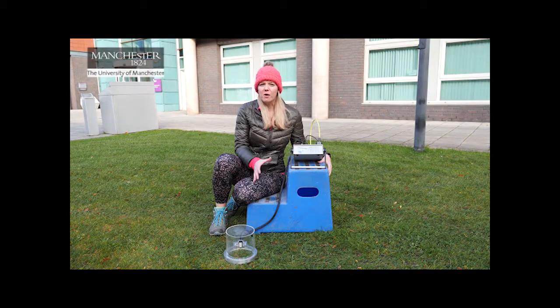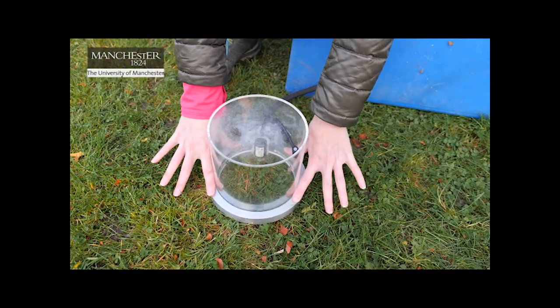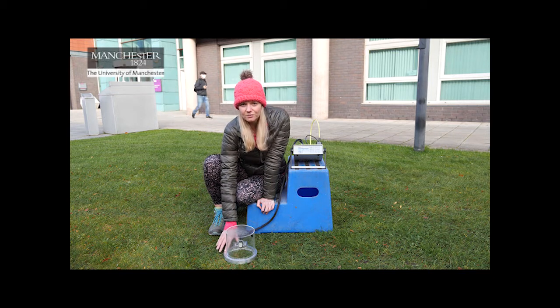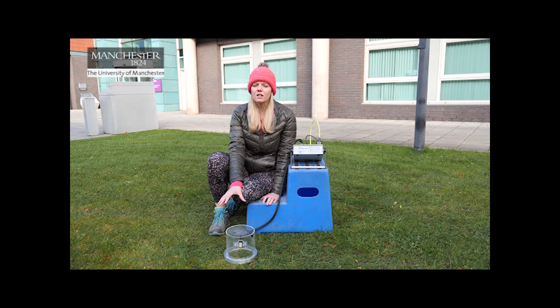Now that we know how both instruments work, we're going to use them to take some measurements — some practice recordings of CO2 fluxes from the surfaces around us today. We have our gas assimilation chamber with a nice tight airtight seal, and here we're going to be measuring and monitoring the carbon fluxes from grass and the underlying soil. It's a November day, about 10 degrees, not particularly sunny, and we have soil and vegetation here. Before we start the reading, have a think — do you think the concentration of CO2 in the chamber is going to increase or decrease over the measurement period?